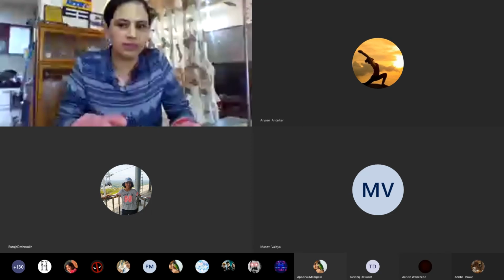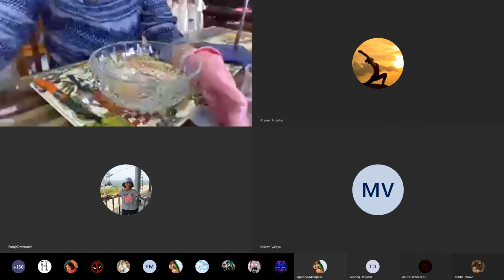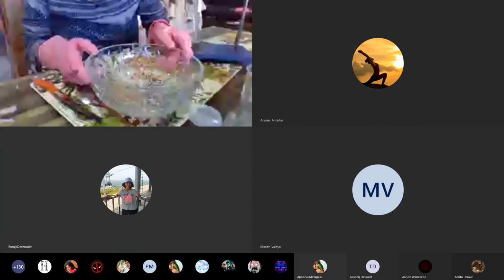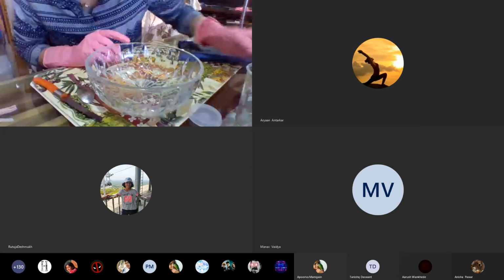Let me adjust the camera. Is this fine? In this water, I'm going to add a little sodium, not very much, because I have to take a lot of precautions also.